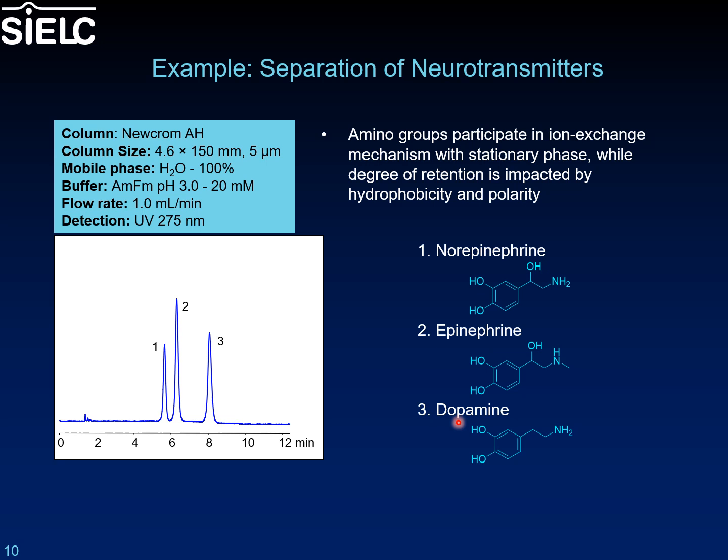This is because it has a lower count of hydroxyl groups in the overall structure to interfere with hydrophobic interactions, and this overcomes the now once again primary substituted amino group in the structure.